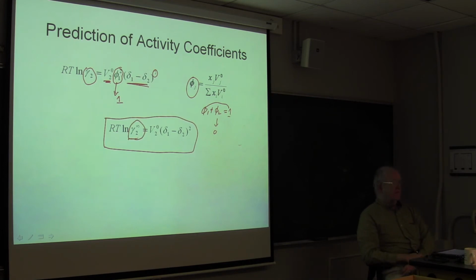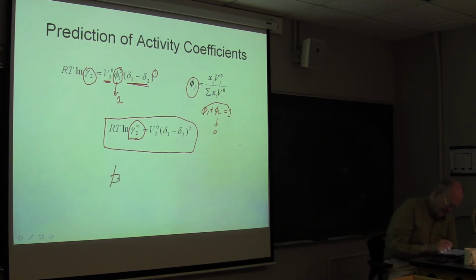What good is this? Where have you seen an infinite dilution activity coefficient before? Beta, for instance. Yep. Beta for gas chromatography.